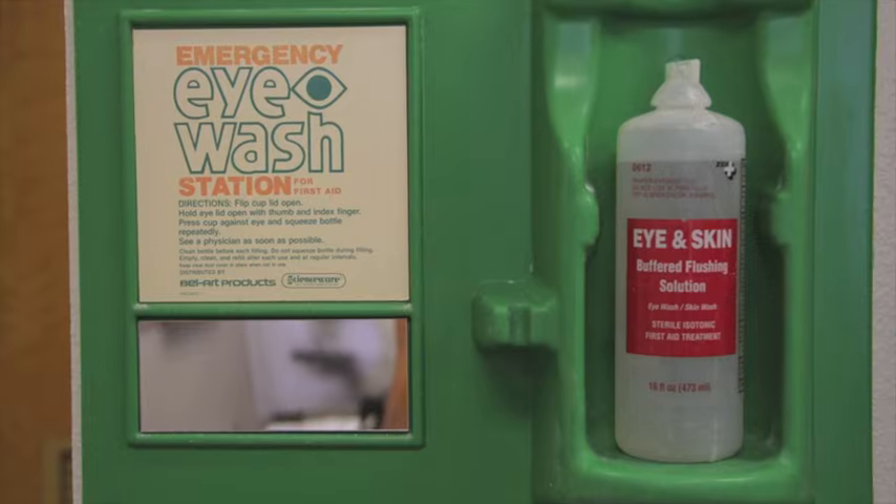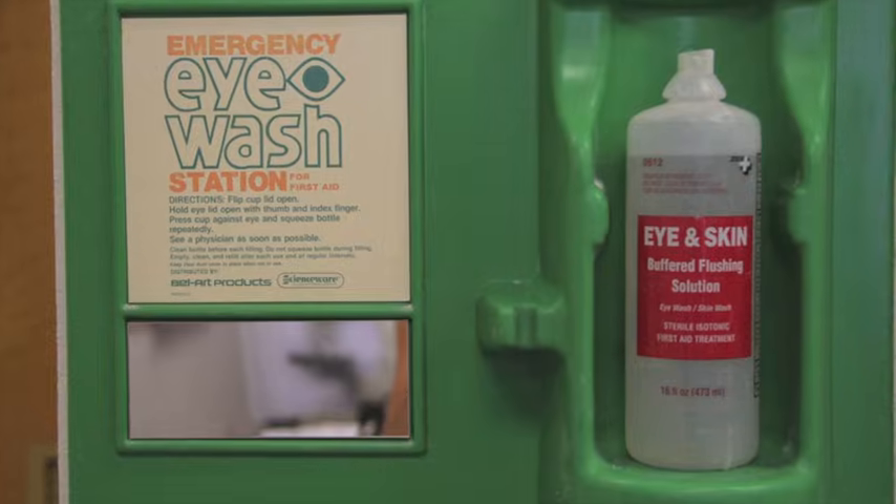Notes about safety: the preserving solution the heart is in is safer than formalin, formaldehyde, or paraformaldehyde, but is not safe for the skin or eyes. Let's take a moment to find the eyewash station, sinks for skin washing, and the first aid kit.